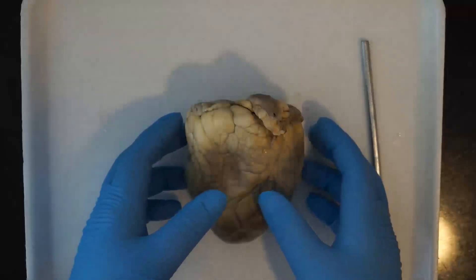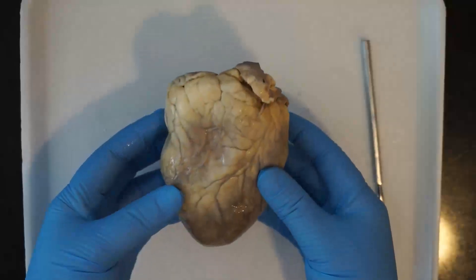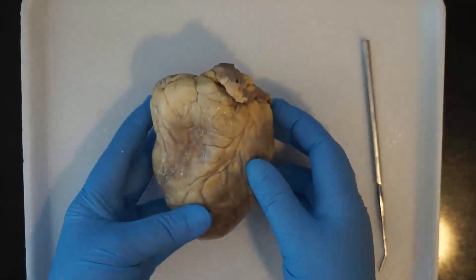We're going to start by figuring out the front and the back of the heart. The front is taller and rounder, and the back is flatter and shorter. Put your heart so that you can see the front.